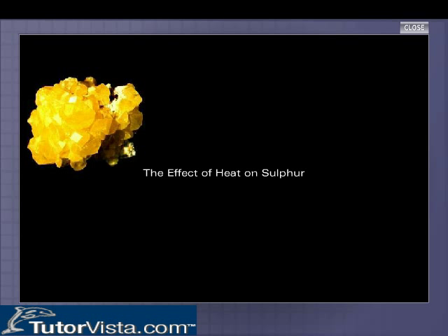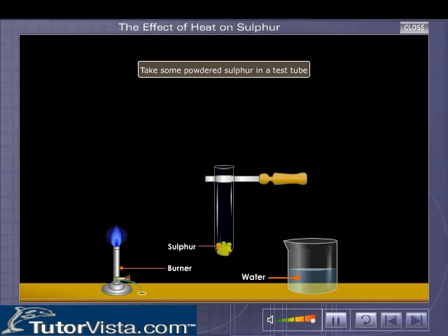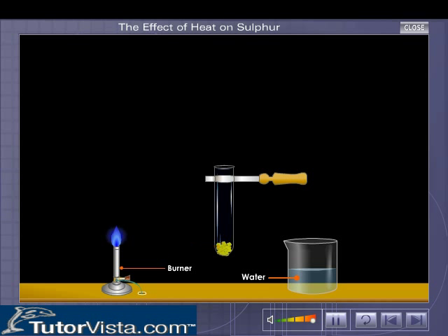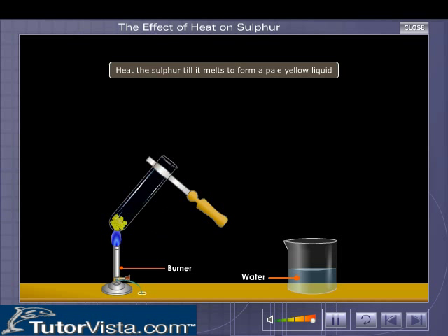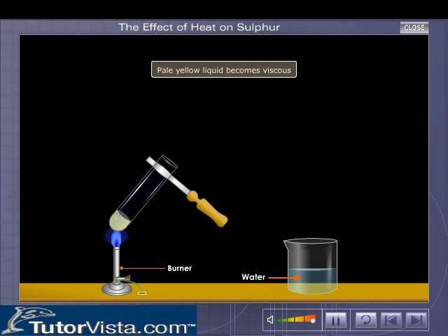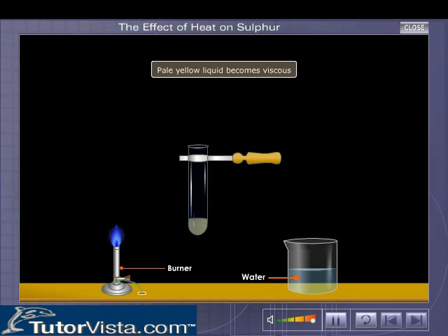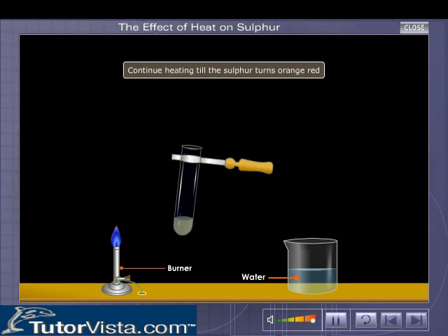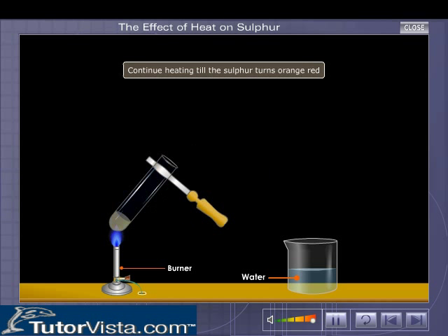The effect of heat on sulfur: take some powdered sulfur in a test tube and heat the sulfur till it melts to form a pale yellow liquid. Observe that the pale yellow liquid becomes viscous on further heating.